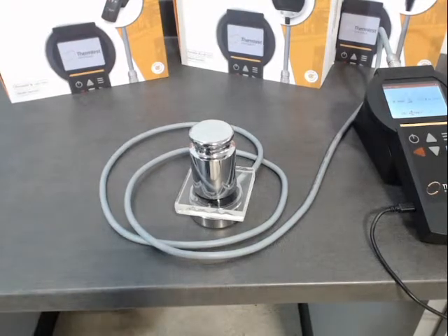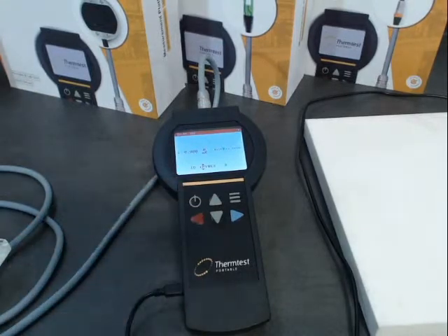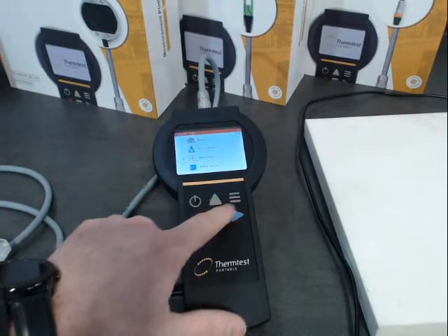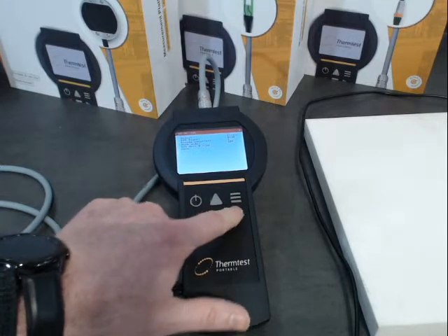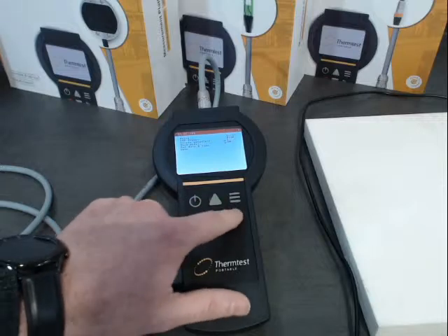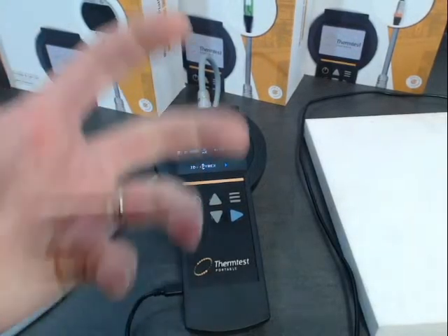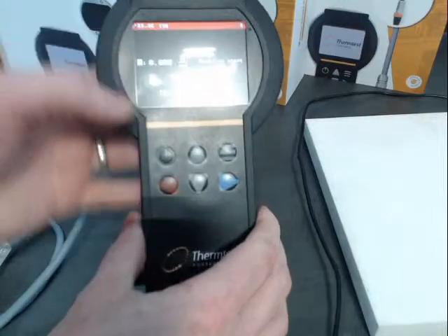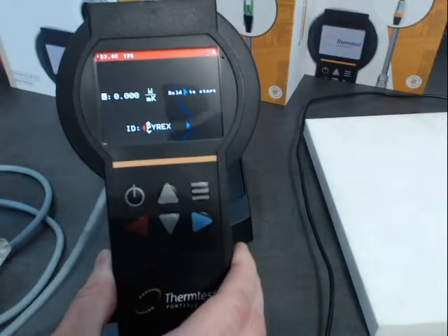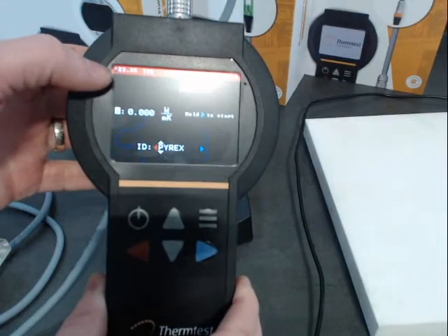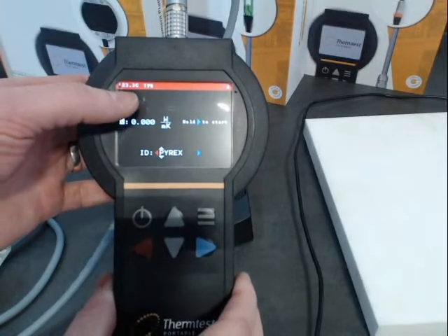Now that we have that set up, I'm going to share the screen. After reviewing this on camera I noticed it's a little hard to see, so there's a setting we can go into — we can turn it to dark mode, which will be a little bit better. So dark mode, hit OK, then save that. Now we've named it for Pyrex. You can manually name this by toggling up and down on the letters. You can see that it recognizes the TPS sensor, and all of these sensors record the environment temperatures.